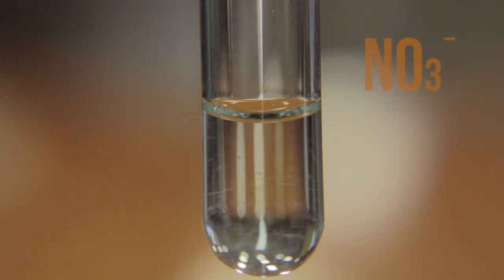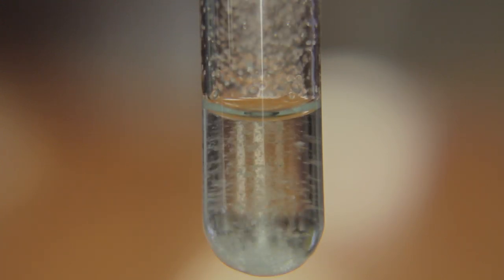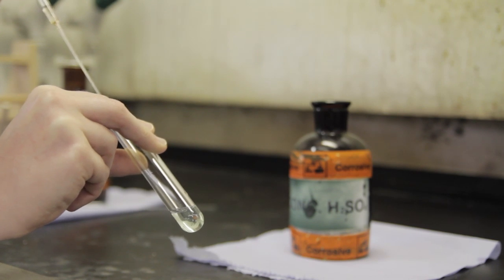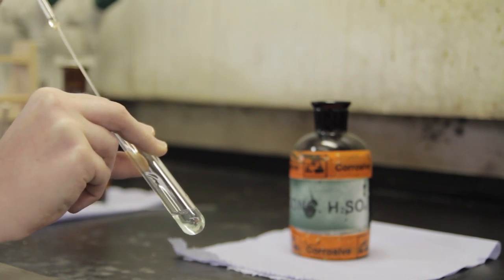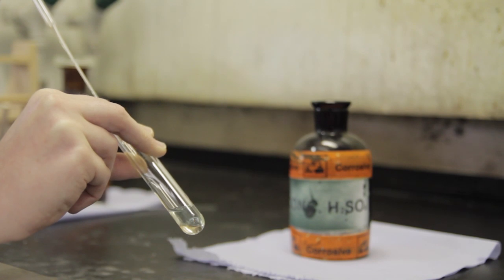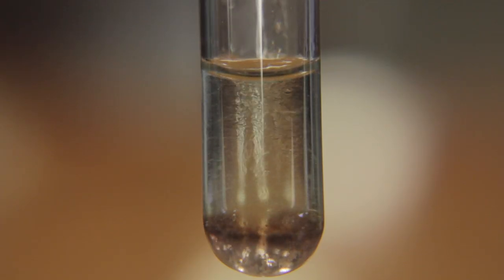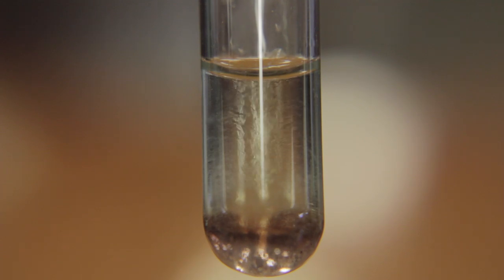The nitrate anion is acidified using dilute sulfuric acid. Solid ferrous sulfate is added and then, working in the fume hood, the test tube is held at an angle and 4-5 drops of concentrated sulfuric acid are allowed to run down the side of the test tube. The formation of a brown ring confirms the anion is nitrate.